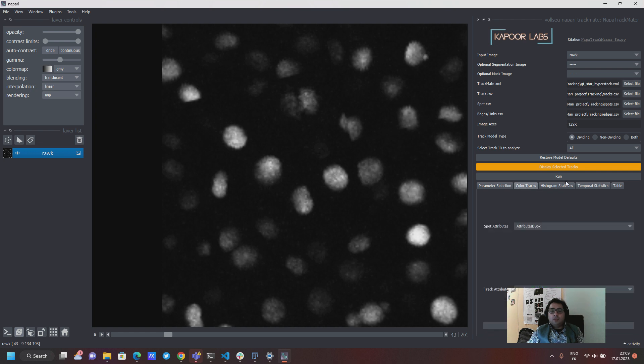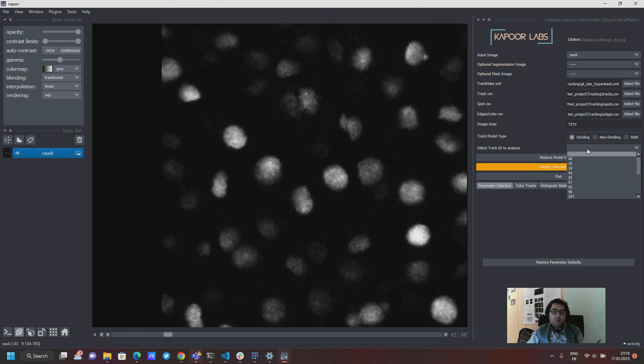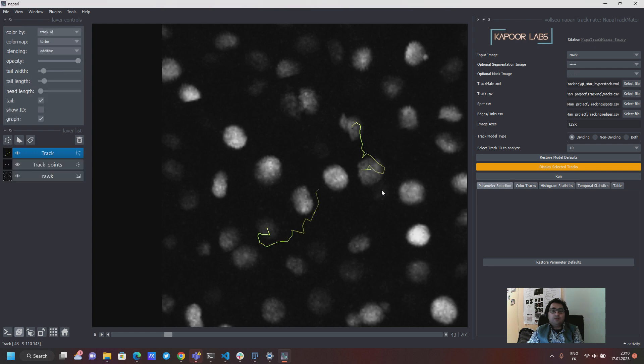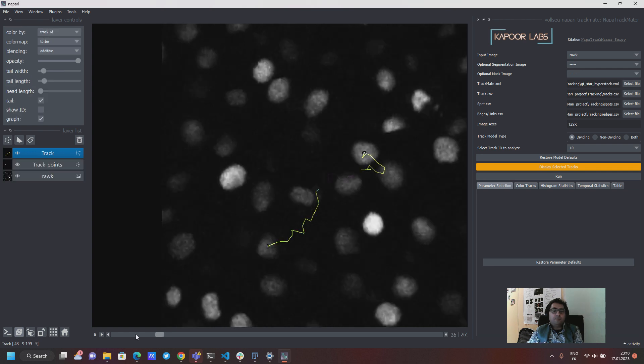So what you would do is say let's say I want to see a dividing track, you will just hit this tab over here and it will load these dividing tracks, and then you have to hit this orange button to actually see this particular track appear as a tracks layer.